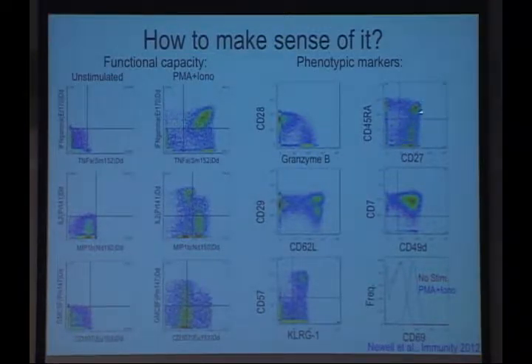These would be the naive cells, and then when they lose CD45RA, they become memory cells, and these would be effector cells that have also lost CD27. And then the latest stage effector cells regain CD45RA expression. So the question is, how do we fit this paradigm in with all the other markers, and how accurate is it? And combining that with all the functional capacities of the cells.